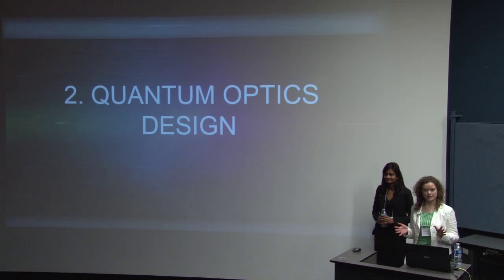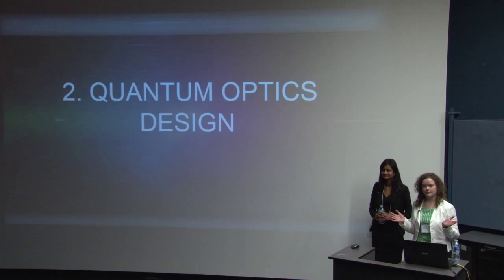Essentially what we've done is we've separated the detection mechanism from the optical setup. So if you had any sort of target detection mechanism that involves getting your magnetic particles close to the surface or just free-floating in space, our setup would be able to detect this change.